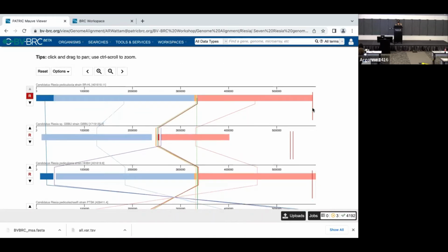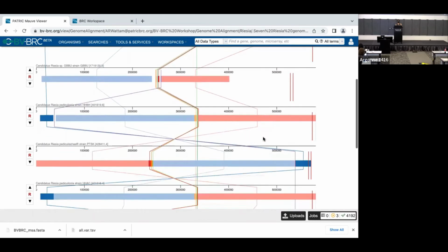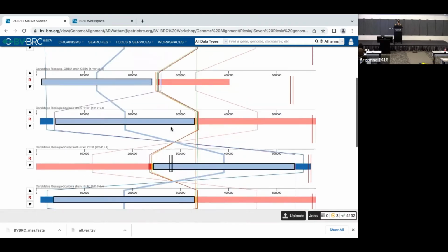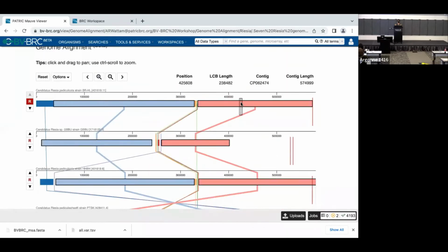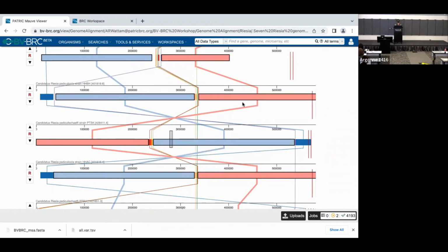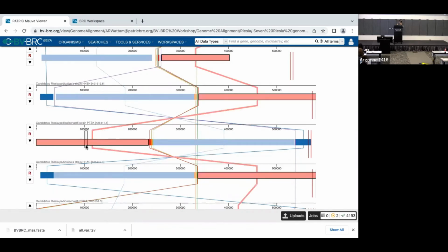What do these big red lines mean? They're the indication of contigs. Here is a chimpanzee one, and then another chimpanzee one. And look at this. So it's showing this big section, and when you mouse over it, it's showing you where all those things are. And so it's showing that this is at the end of this genome and at the beginning of this genome.